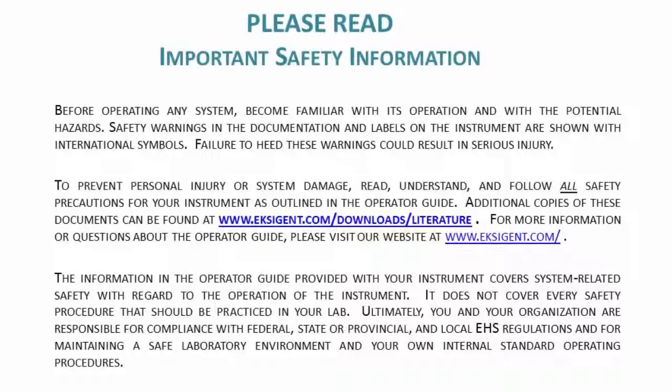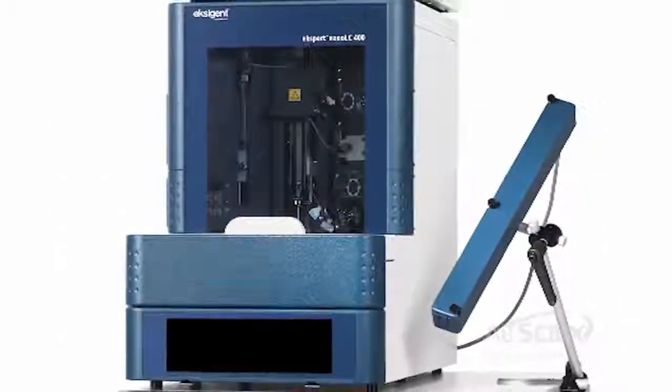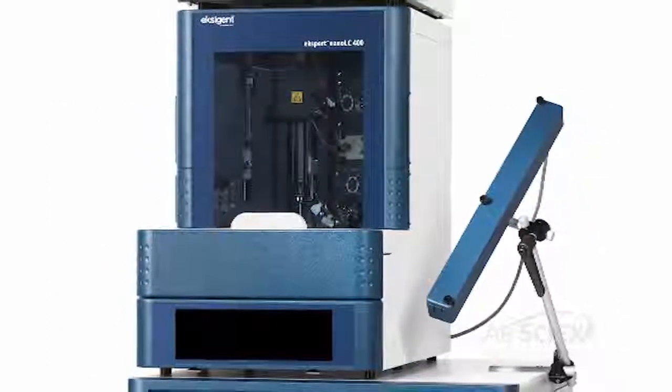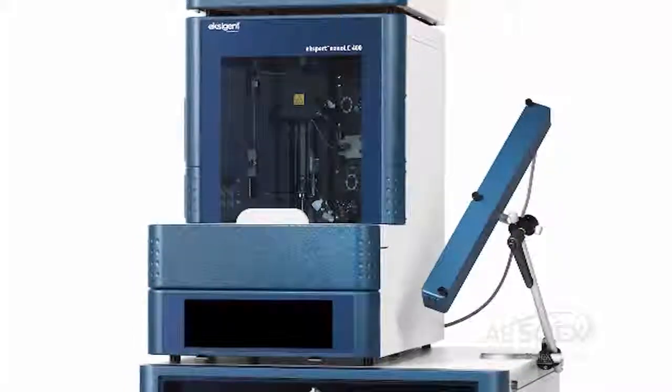Please read important safety information before watching this video. To fill the pumps with liquid if they run dry or to replace one solvent with another, follow this protocol.